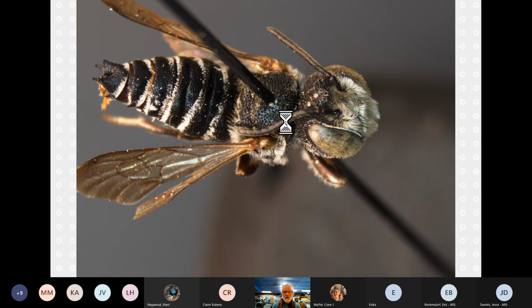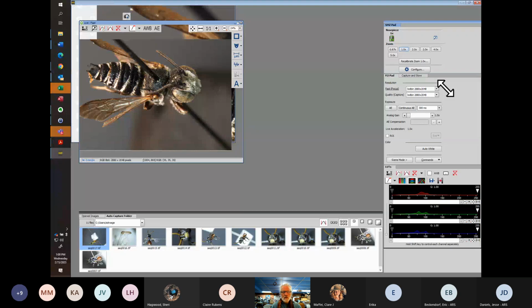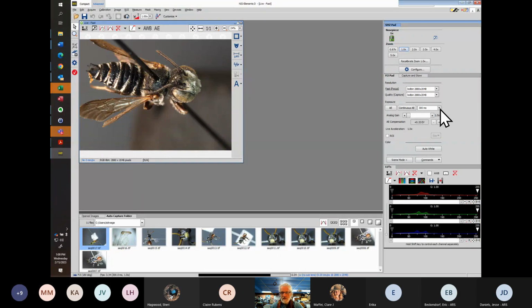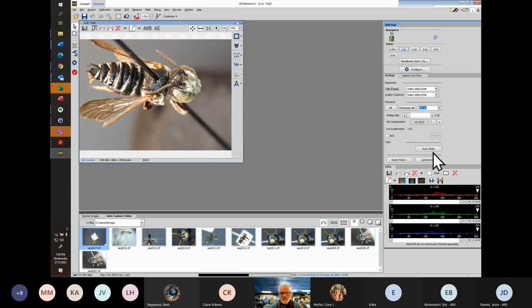I'm going to get out of this view and add more light in so we can see into those recessed areas. So let's move to, I'm going to try 90 here. Oh, that's the wrong way. We're going to go up to, how about we're at 500? Oh, that's better. I think I'll go one more. For some reason, it seems to be working at a lower light level, but I maybe didn't have a light on. How about 800? Okay, let's try that.